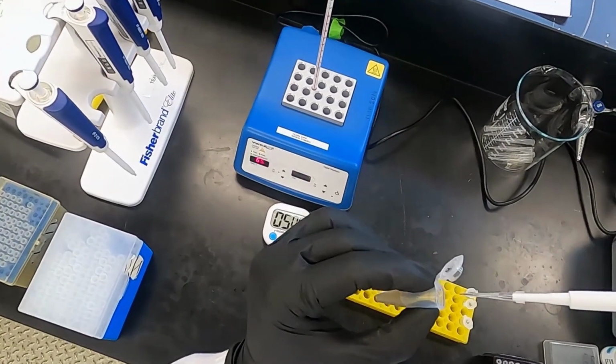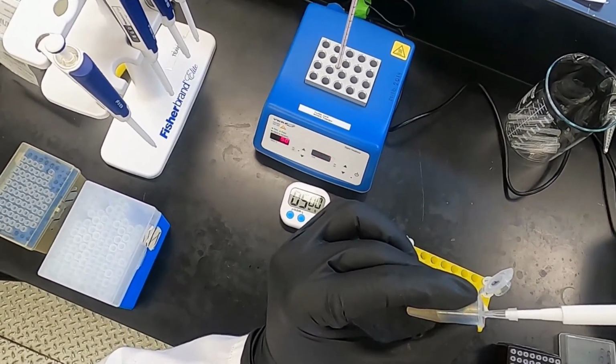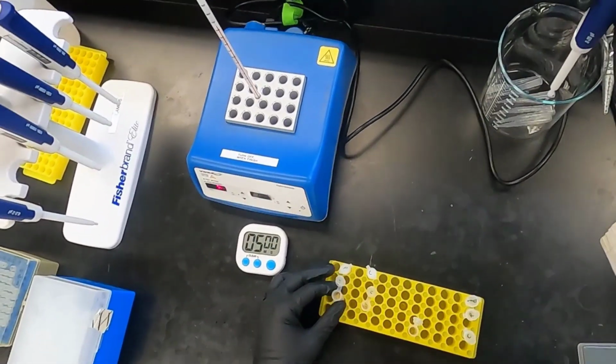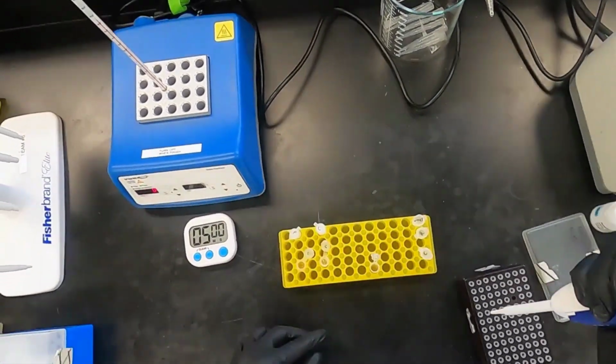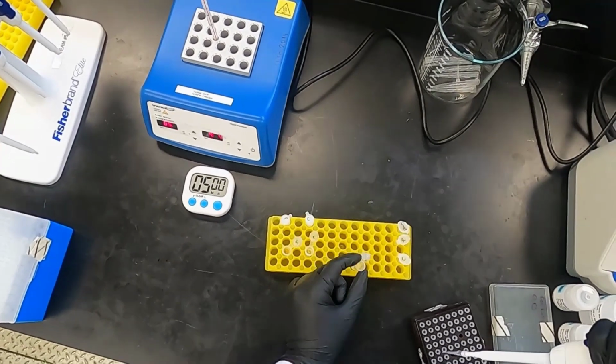Because it is a small amount, you want to be sure that you are in fact adding it to your solution. And make sure to switch pipette tips between. And now the second sample.